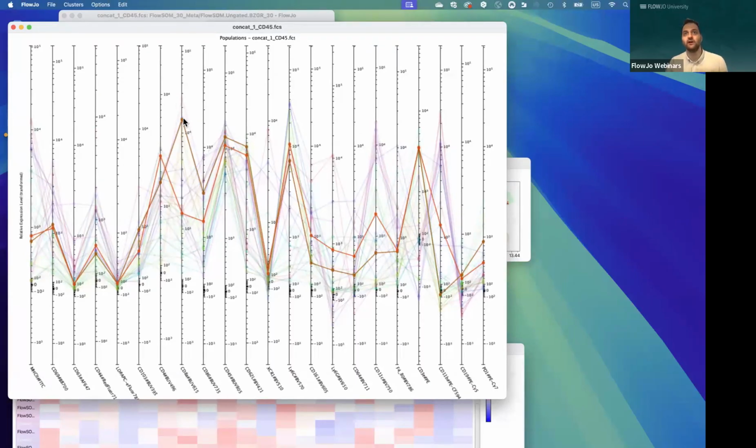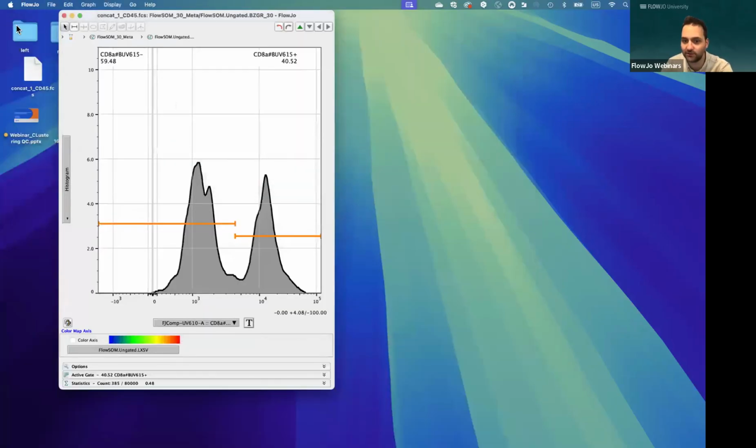Otherwise I would have to look manually at all those clusters, which would really be very difficult. But that way Euclid gave me directly the point where it told me, okay, this cluster is very, very bimodal for CD8. So have a look at it and then split it. Yeah, so that's the way we would work with Euclid and quality control.